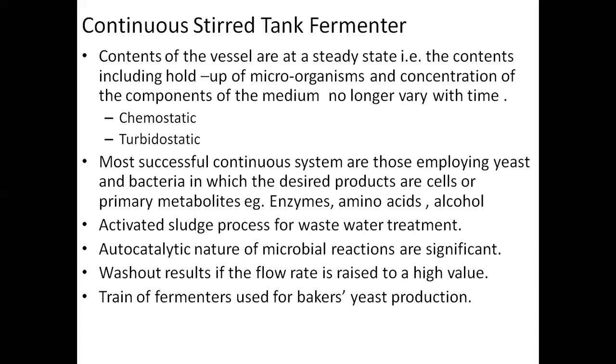Basically, these continuous systems employ yeast and bacteria to get the desired products as well as primary metabolites, including enzymes, amino acids, and alcohols. These types of reactors are also utilized for the activated sludge process for wastewater treatment as well as the production of baker's yeast.